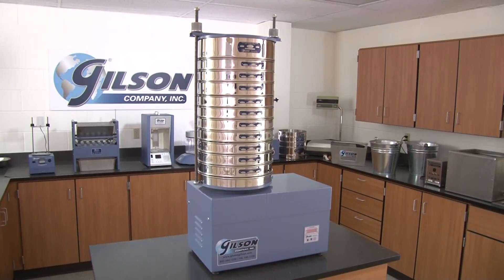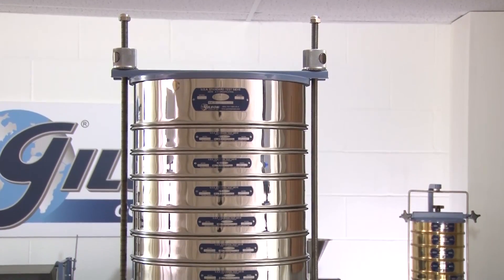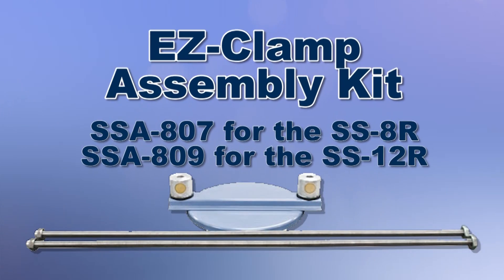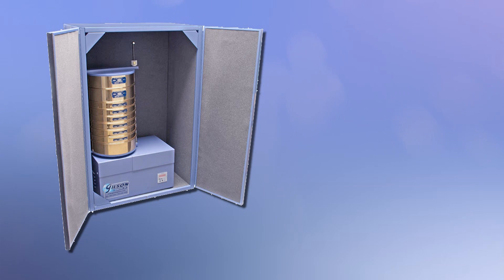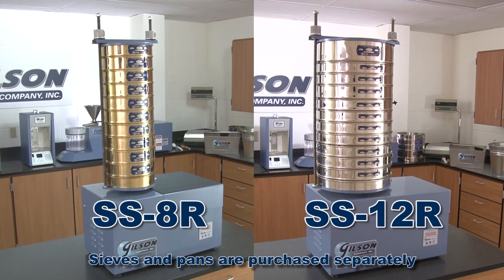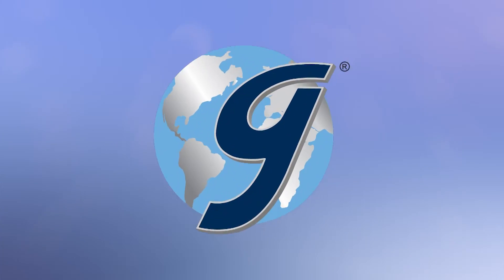Current users of older SS8R and SS12R sieve shakers can take full advantage of Gilson's innovation and easy-to-use clamping design by ordering the EZ-Clamp Upgrade Kit. And for noise and dust control, the optional Gilson SSA805R sound enclosure with its full-width hinged doors and one inch of sound attenuating foam make the SS8R and SS12R the perfect choice for your material testing lab.